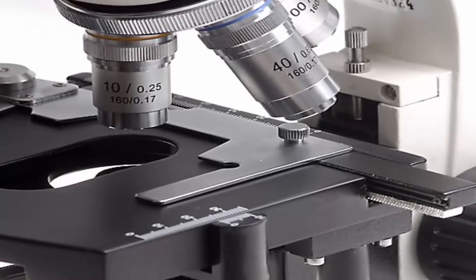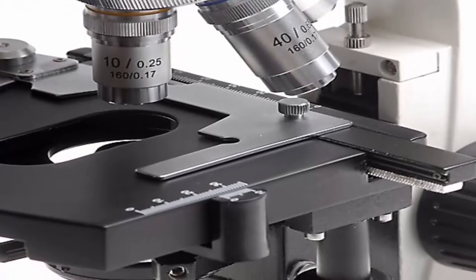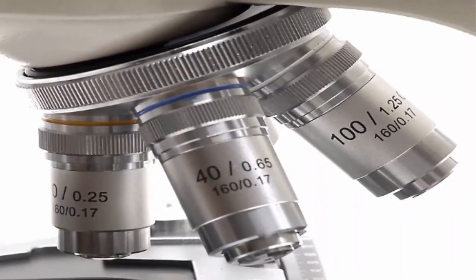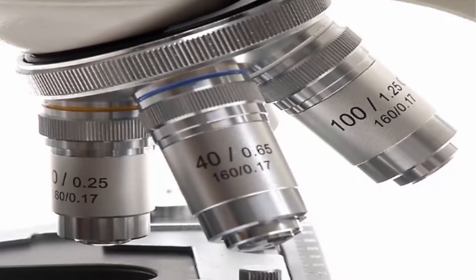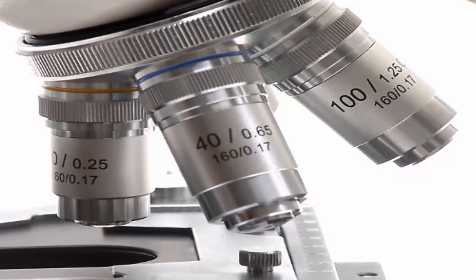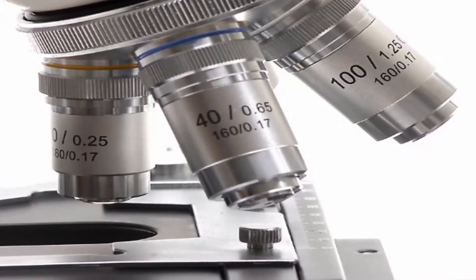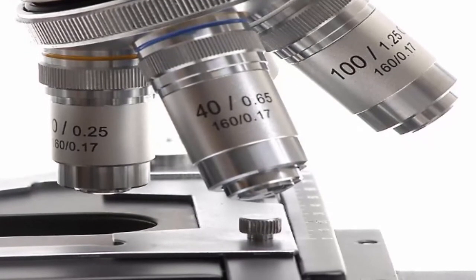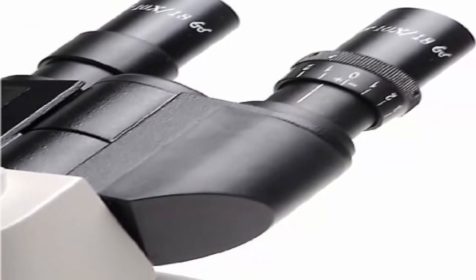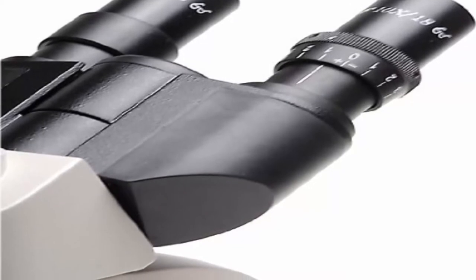You will immediately be able to tell the difference over cheaper scopes, making study and exploration more fun and productive. Binocular style with rechargeable LED illumination gives amazing clear, sharp views. It's packed with professional features and solid industrial design. Ergonomic 45-degree incline makes it comfortable and easy to use hour after hour. The head rotates a full 360 degrees with two wide-field WF10x eyepieces and rubber eye cups.